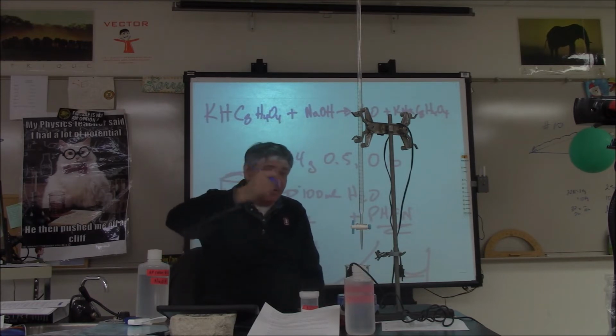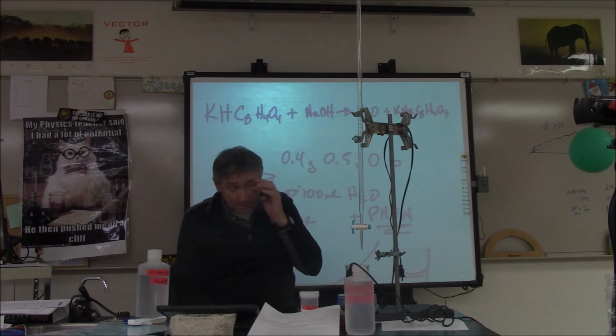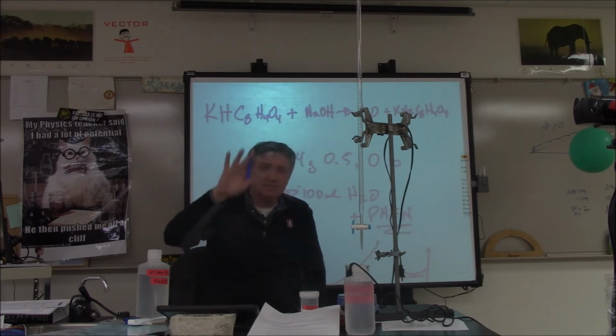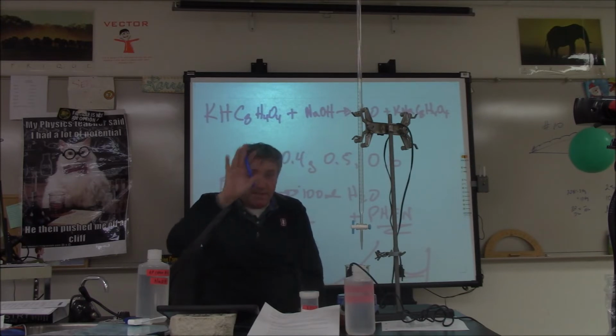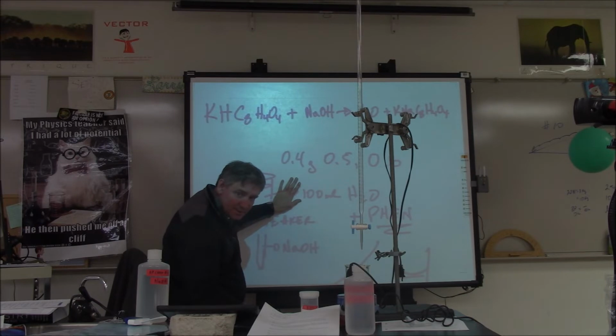But if you're continuously adding 2 milliliters at a time, it's no good, okay? You're going to blow right through it. So this just takes a little bit of practice, but you'll see. When in doubt, err on the side of caution.